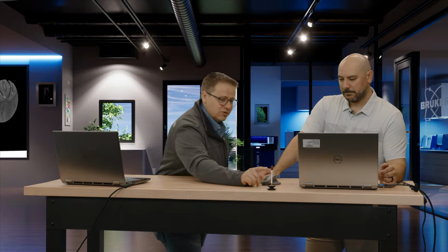Now you had something about that size sitting around the lab the other day. It was 3D printed metal. Then what do we do? kV? Max. Whatever, however high you can go. Even if it's aluminum, still max. And then you're just going to have to count. The denser it is, the more counts you're going to need, so maybe more frame averaging. So that's the idea: higher absorber, you go to higher kV. And then the milliamp, you just follow that to hit your wattage.